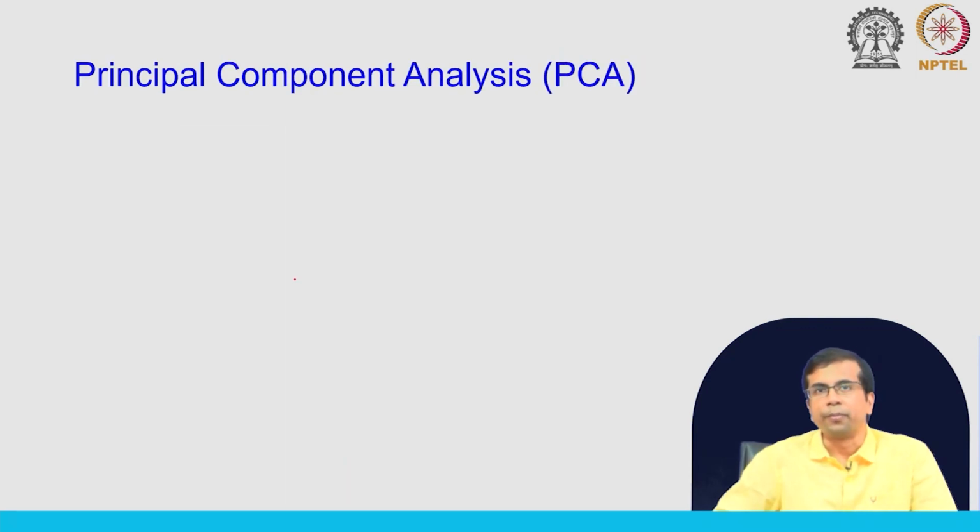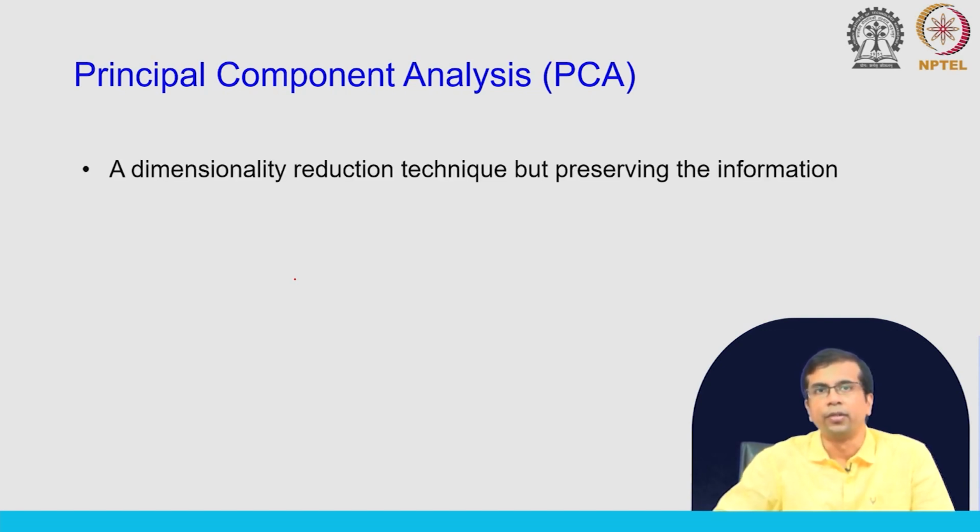So, coming to the principal component analysis, or PCA. This is not a very detailed discussion. I will just very briefly mention what we do in PCA, but you can find out a lot more, as there is a much more elaborate analysis that you can do with PCA. This is a dimensionality reduction technique that tries to preserve the information that is present in the data.